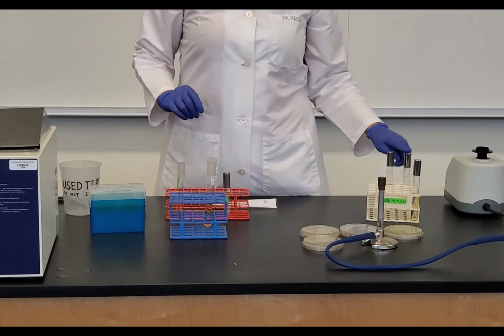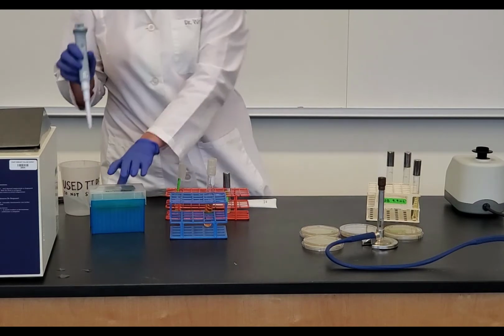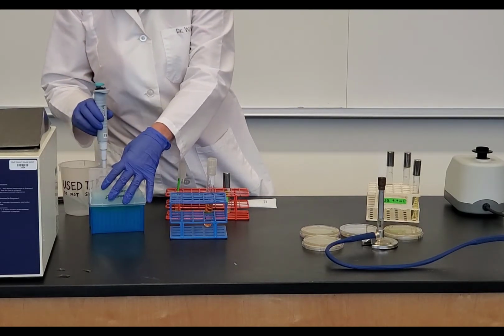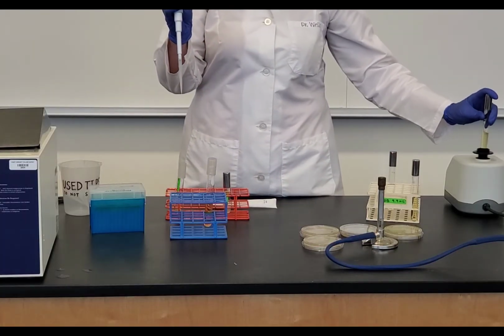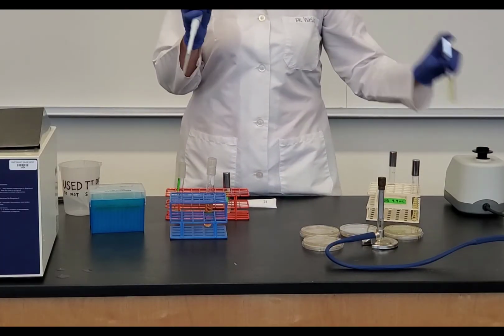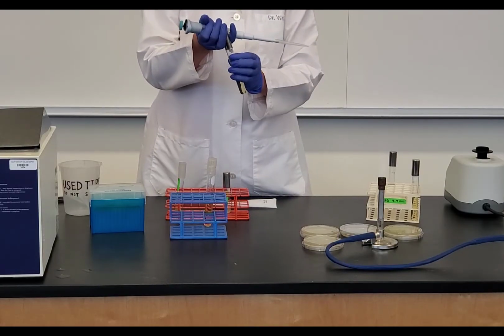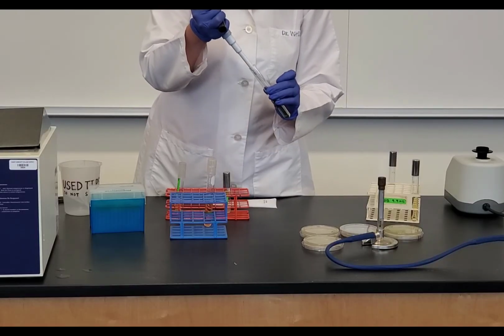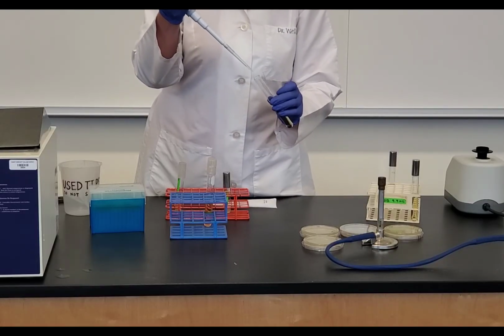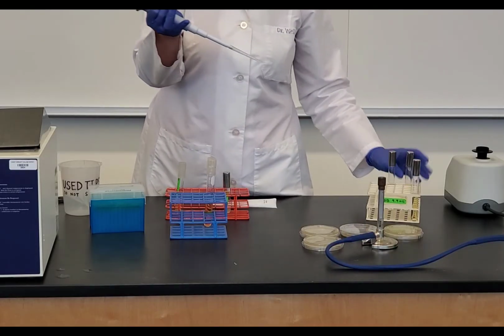I need to add both the virus as well as the E. coli. So I'm going to take my pipette, and again, I'm going to vortex this one before I go into it. I'm going to flame it, draw up 100 microliters, flame it, close it, put it aside.